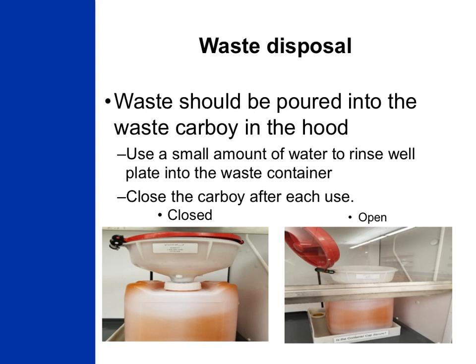As we are working with solutions containing transition metals, please make sure you pour all of your waste in the waste containers in the hood. As always, check and make sure that the lid to the waste container is open before you pour in your solution.